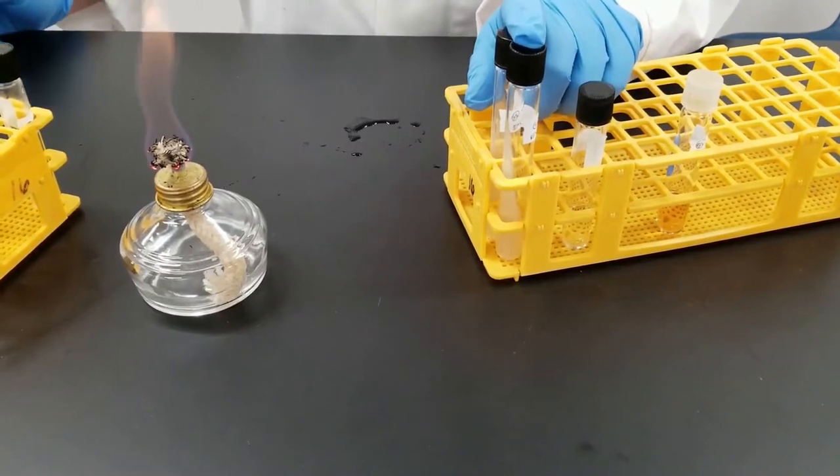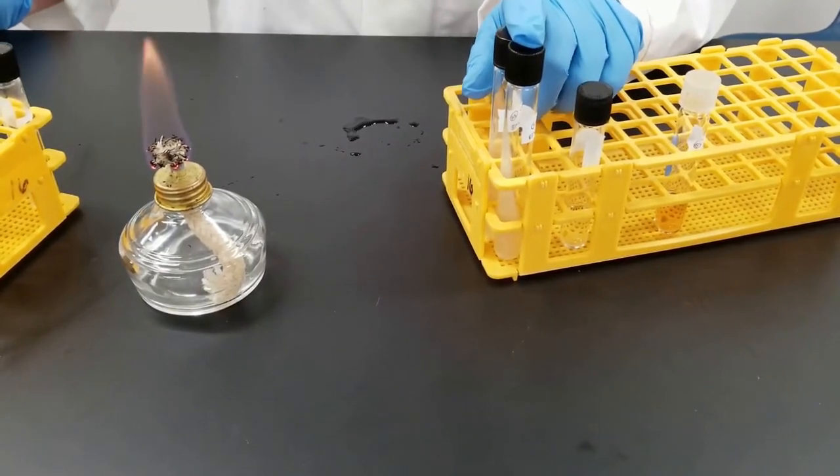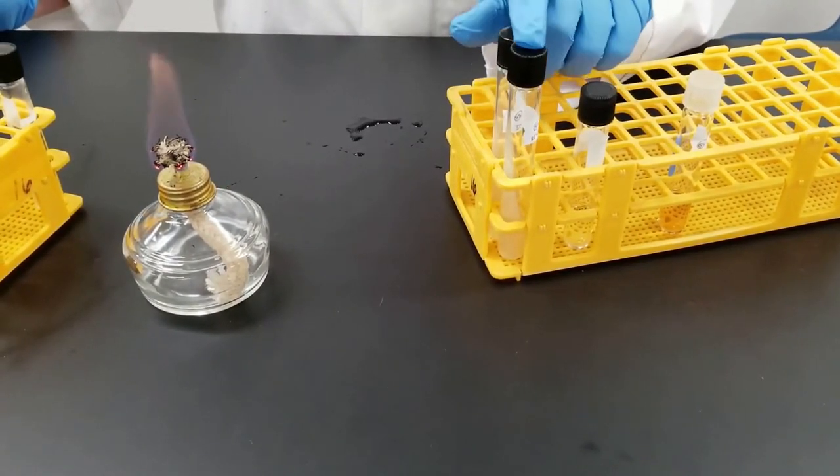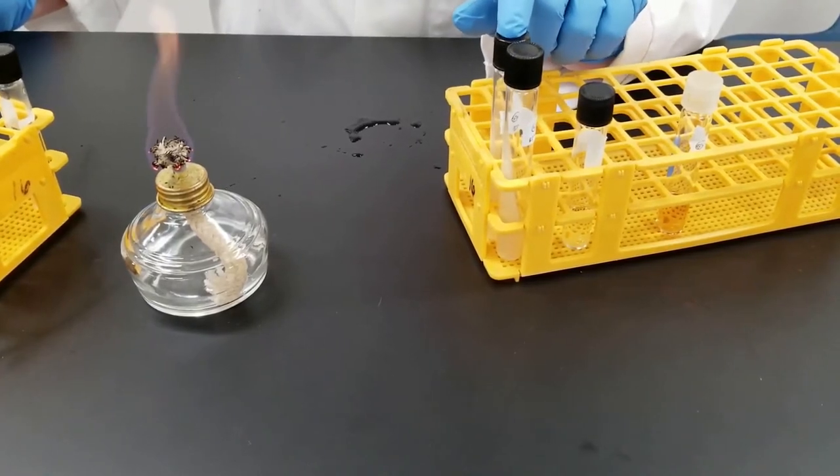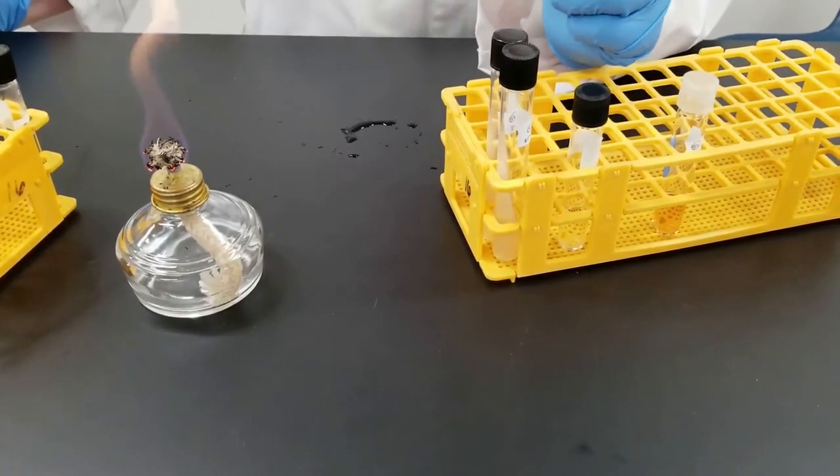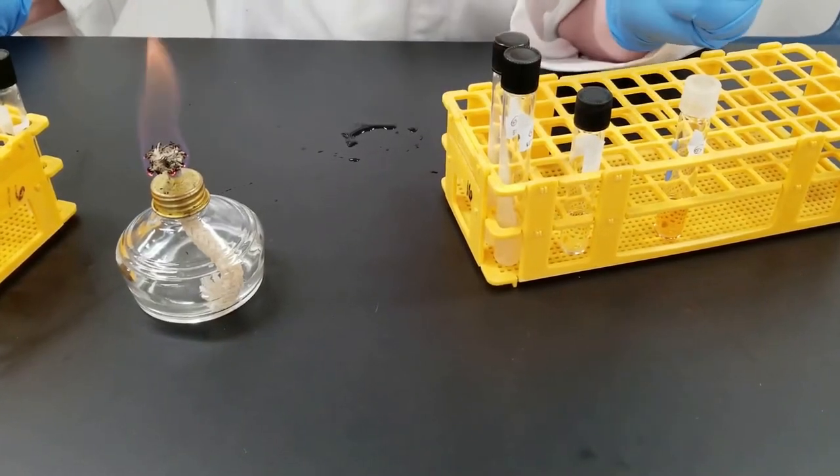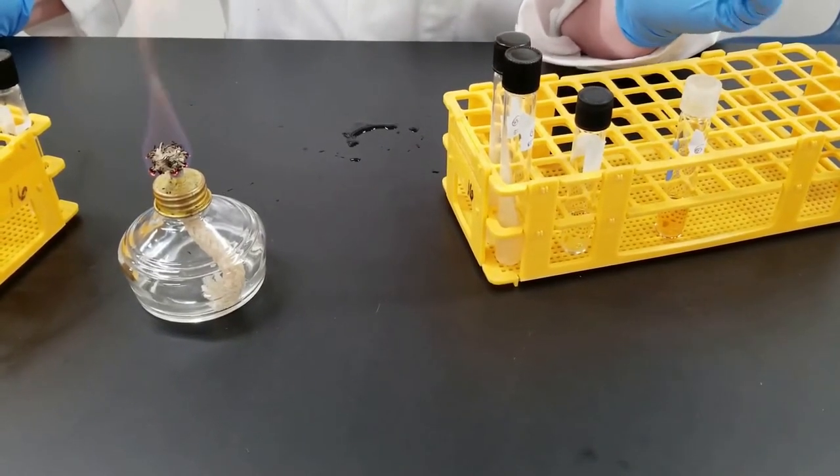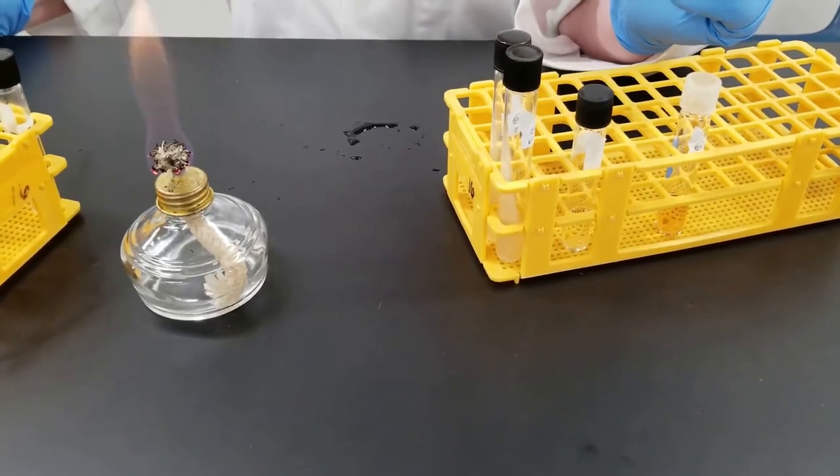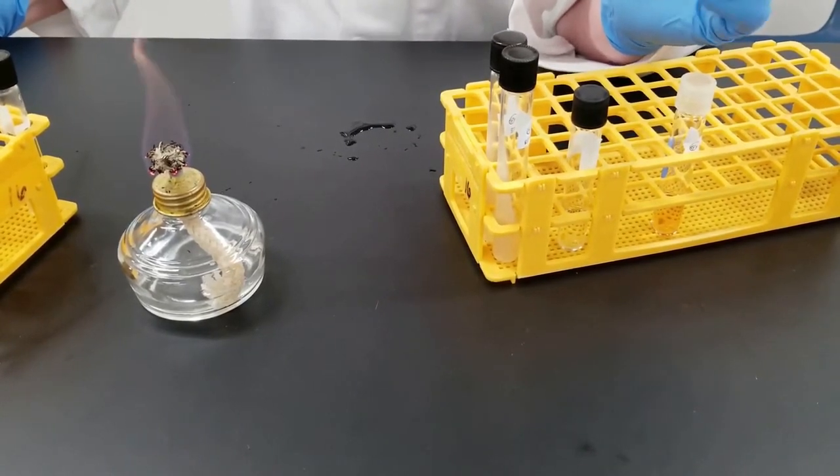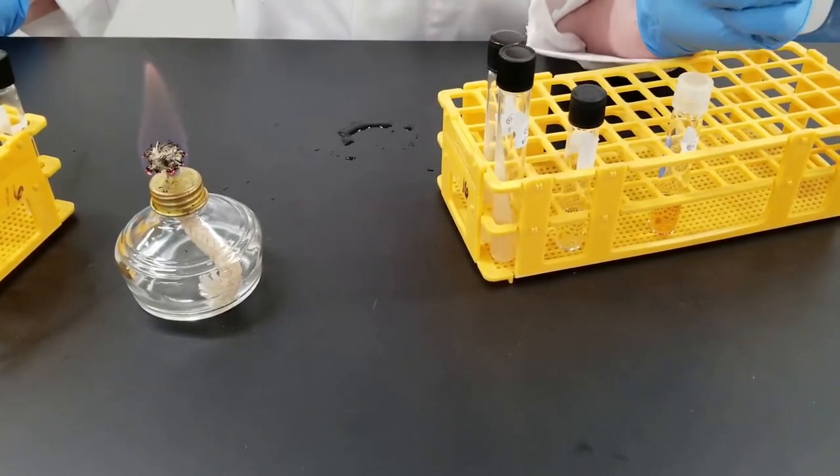We're going to be overall in this experiment looking at growth characteristics. So we'll see in this way, is one temperature better suited or more of the optimum temperature? Will you get better growth than the other? So we'll do 37 and room temperature, which is roughly anywhere from 21 to 23 degrees Celsius.